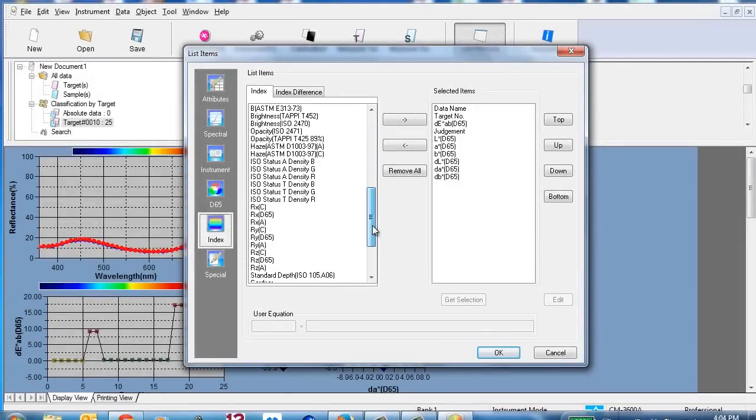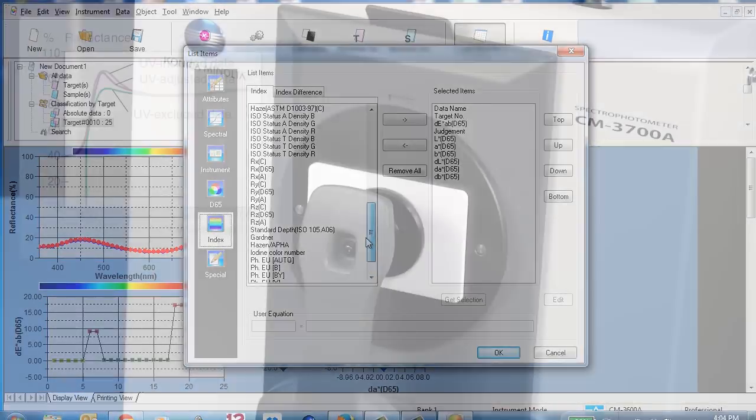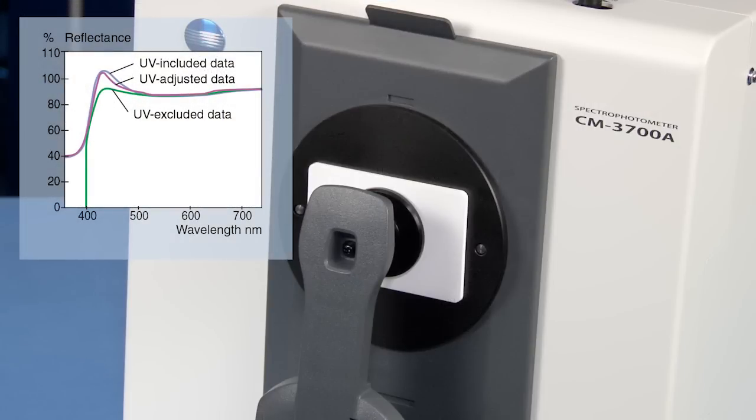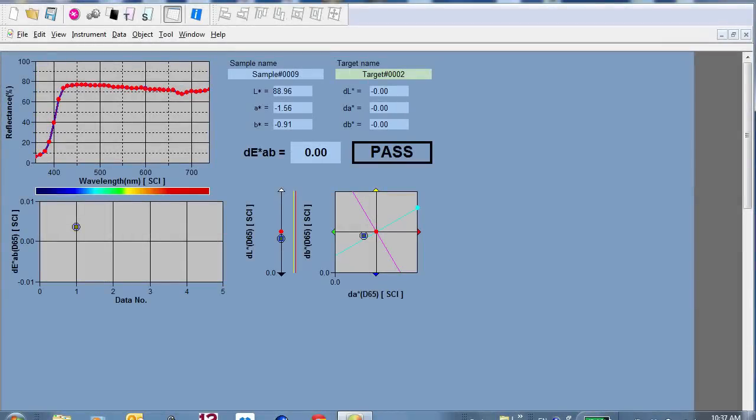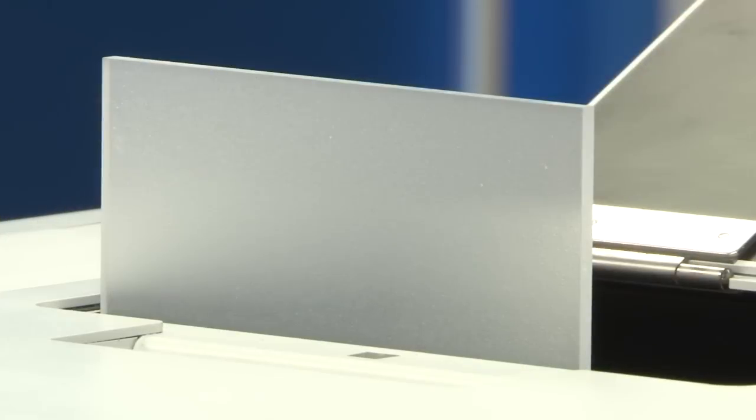Select from 16 illuminates and up to 40 indices to determine distinct color and appearance properties including brightness, whiteness, yellowness, and haze.